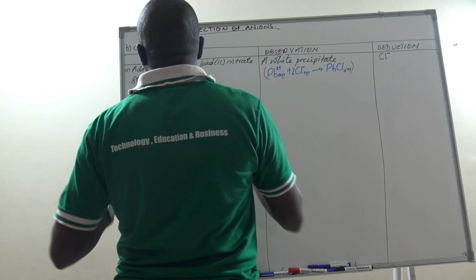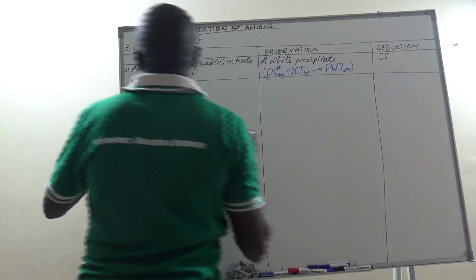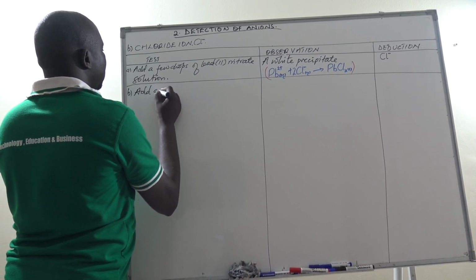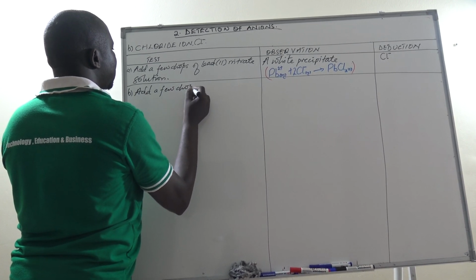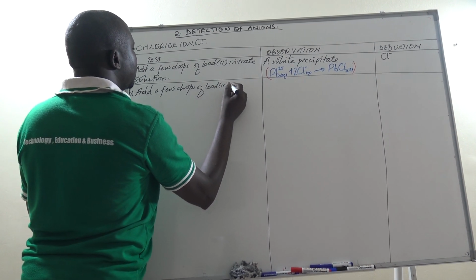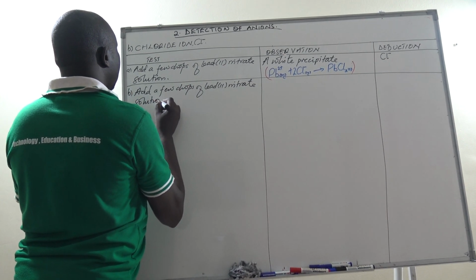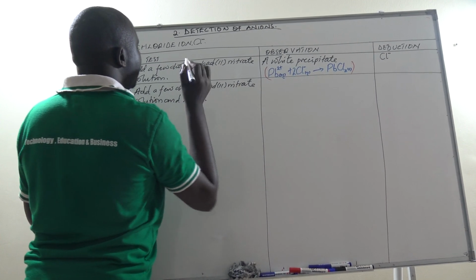Then let us proceed to the next test, that we need to add a few drops of lead(II) nitrate solution and heat the mixture.